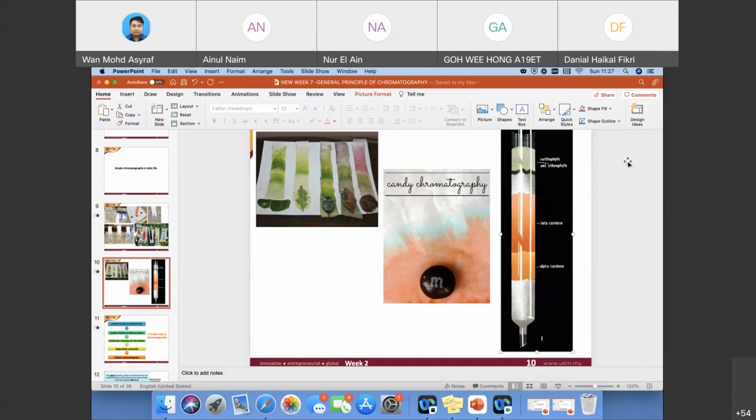So the methanol would be pumped throughout this column, throughout this tube, and it will elute here. It will come out here. Right. So now the job of your mobile phase is to bring all of your analytes, which in this case there are 4 compounds inside your sample, through the stationary phase and elute out here and down here.